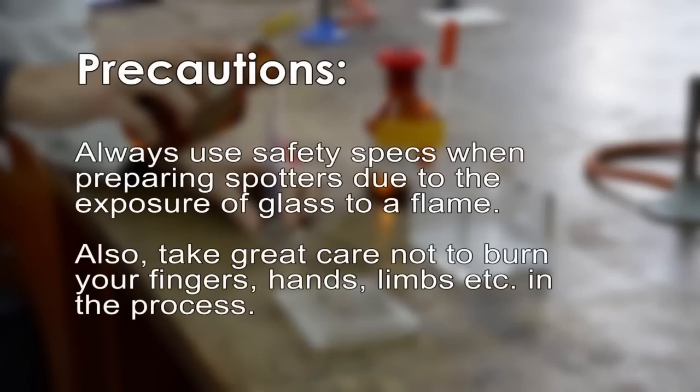Always use safety specs when preparing spotters due to the exposure of glass to a flame. Also, take great care not to burn your fingers, hands, limbs, etc. in the process.